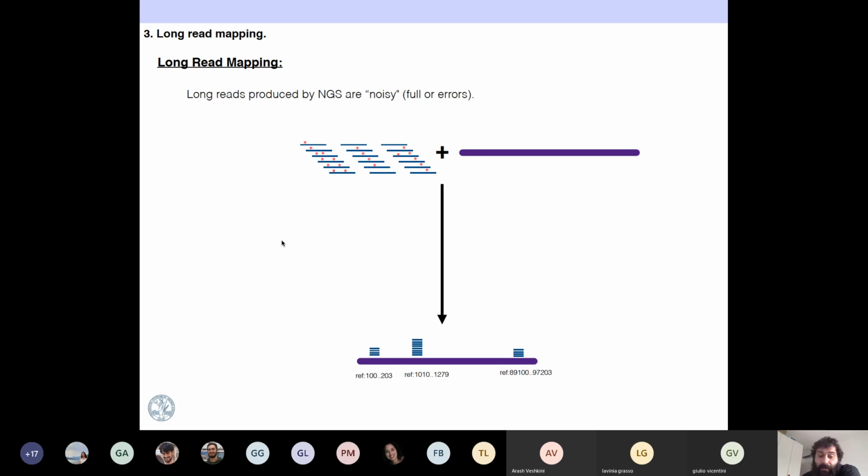Okay, let's put this example. Imagine that I have these reads, and then I'm counting how many of them I have in gene 1, gene 2, and gene 3. So I read the first line. I have one for gene 1. Then I read the second line. I have one for gene 2. I read another line. I have another for gene 2. I read another line, and now I have one for gene 3. So you are starting to have these jumps, and that is not efficient.